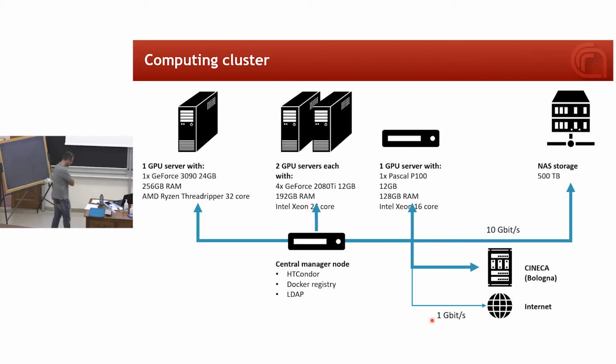You wonder why we just spent millions of dollars so that we could use a human-standard compression engine, not even a scientific compression engine, a compression engine used to make sure humans don't think the edges are missing things. That's what JPEG 2000 does. They were built so humans can view images, not for scientific data. There's a big difference between scientific compression and compression that just tricks human perception.